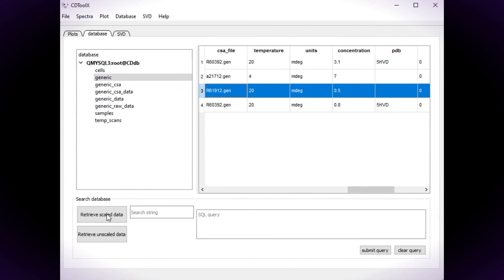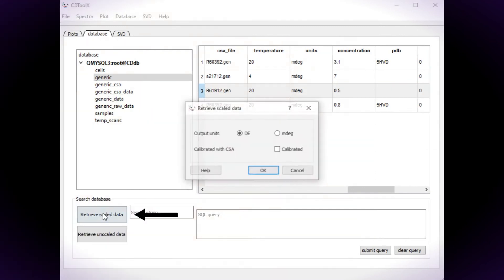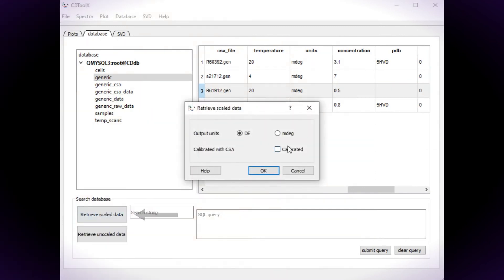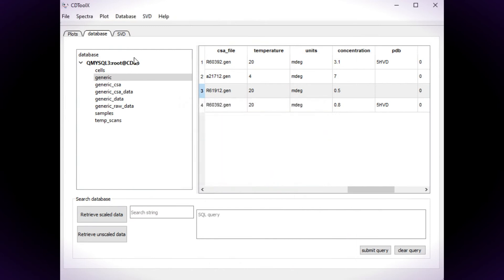Then to retrieve a calibrated spectrum, click on the Retrieve Scaled Data button and check the calibrated checkbox.